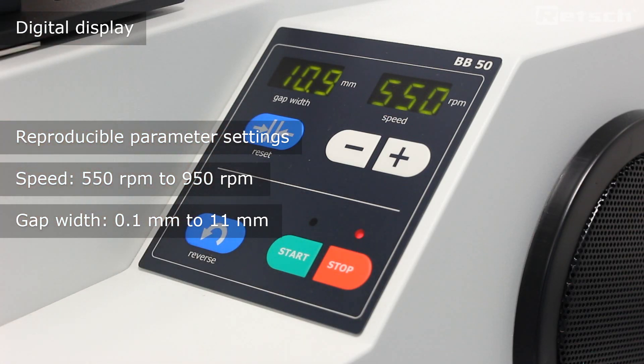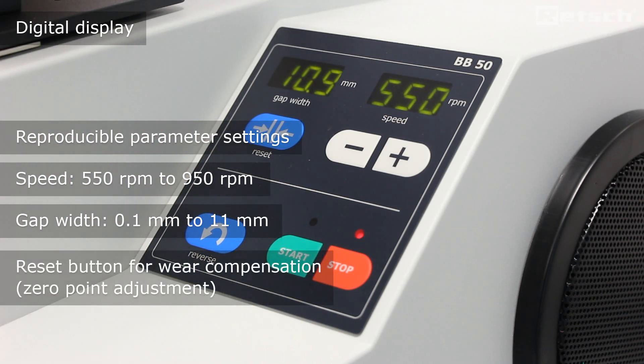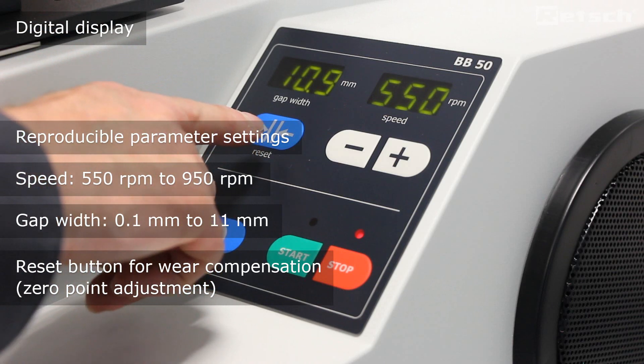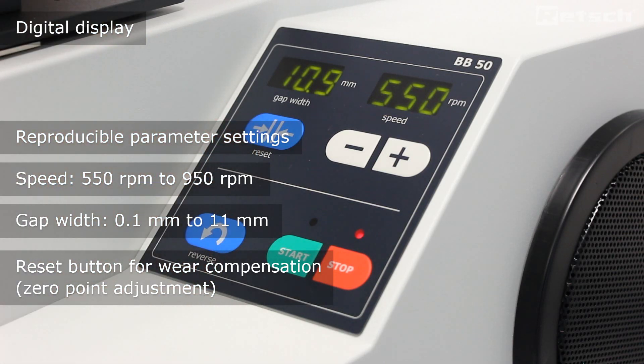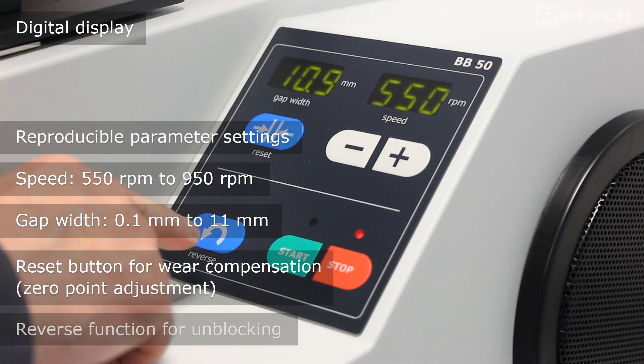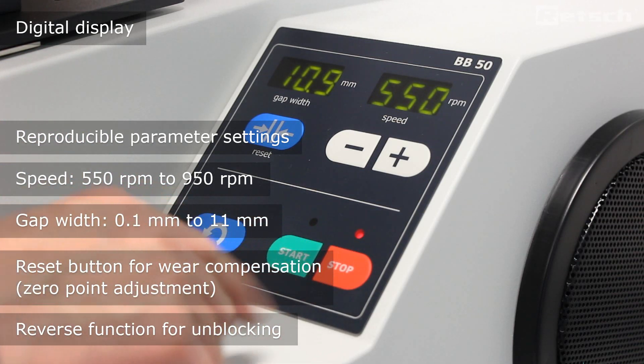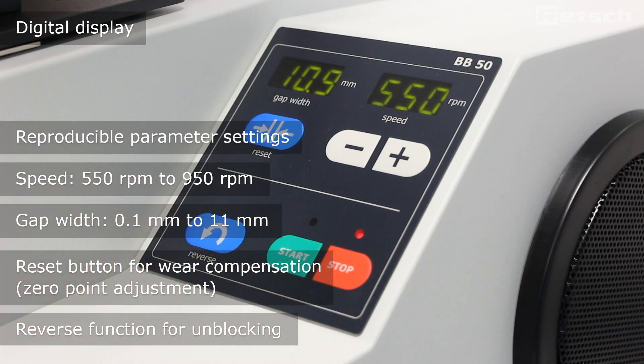To account for future wear of the breaking jaws, this can be compensated for with the reset button, where we can reset the zero point. If the material ever becomes blocked, we can reverse the direction of rotation of the breaking jaws to simply unblock the material. Start and stop are used for activation of the instrument.